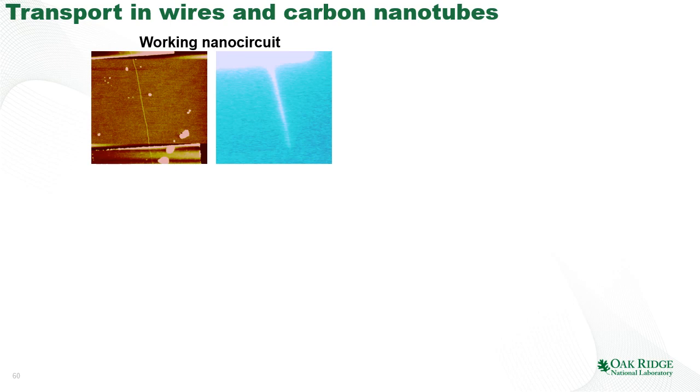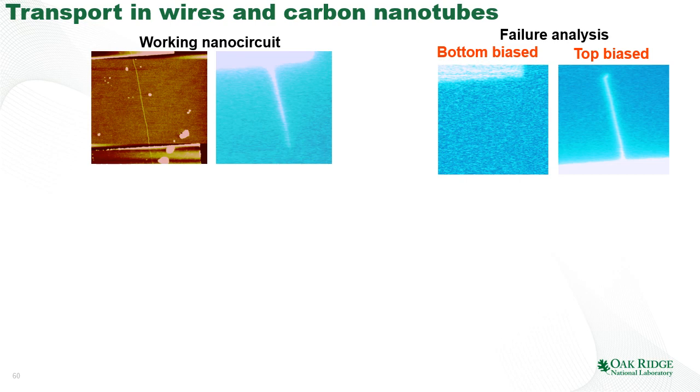Now, in general, application of Kelvin probe microscopy and scanning impedance microscopy for nanowires and nanotubes gives us some very interesting applications. So for example, we can map the potential distributions in the active device. So this is a SIM image of the case when we apply bias to the top electrode and the bottom electrode is grounded, and we see the uniform potential drop across the active device. Again, because we are using SIM rather than KPFM, our resolution is much higher. We don't have to deal with the lateral distribution of charges, and we don't have to deal with the effects of the bottom electrode.